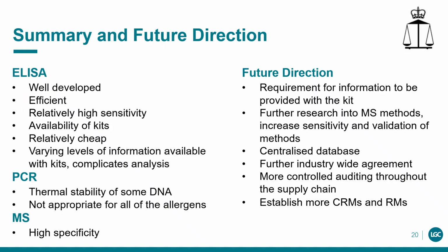Methods based on mass spectrometry are a promising development, with demonstrable high levels of specificity possible. However, further research will be required to ensure the methods are both validated and fit for commercial applications. An open-access centralized database for allergen testing issues, including cross-reactives and matrix suitability, would be beneficial globally.